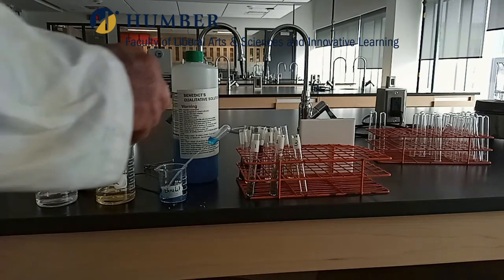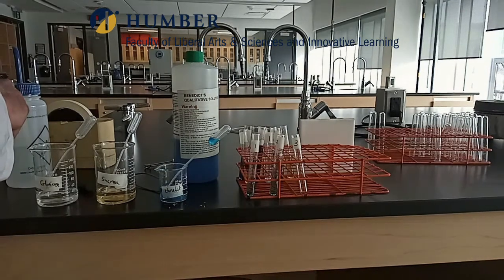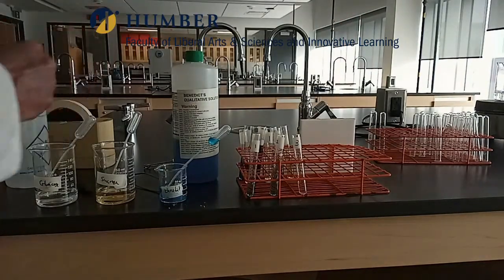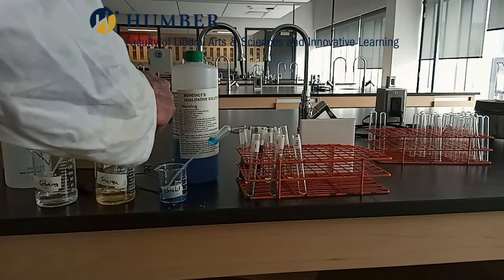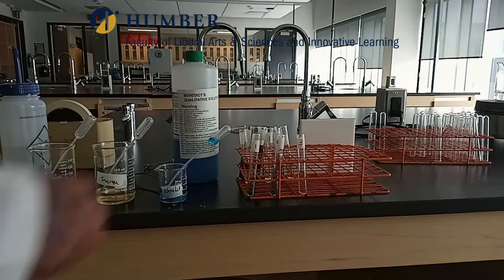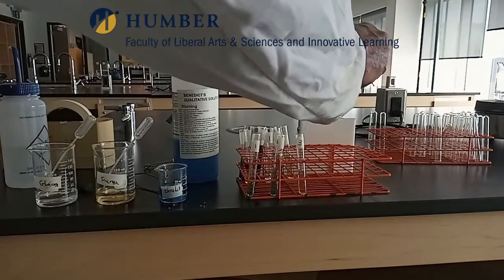In test tube 3, 2 mL of distilled water, 2 mL of sucrose, and 1 mL of Benedict's solution.